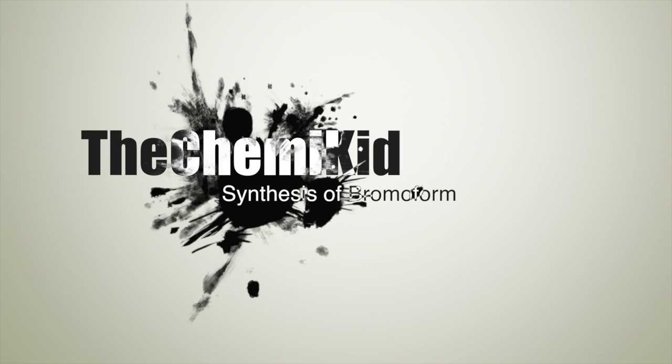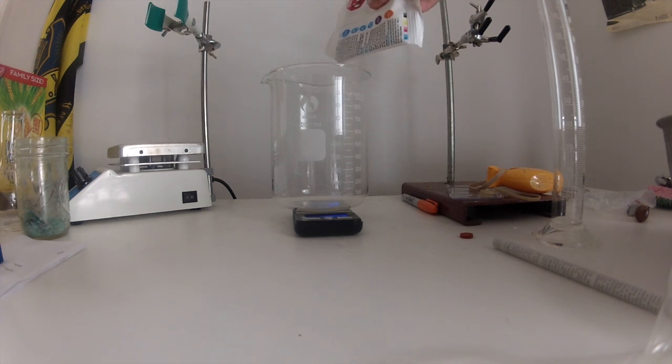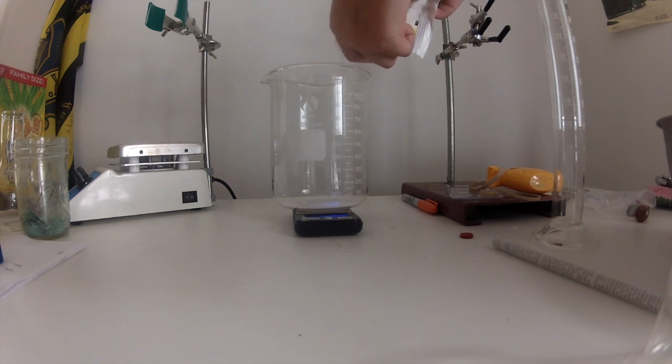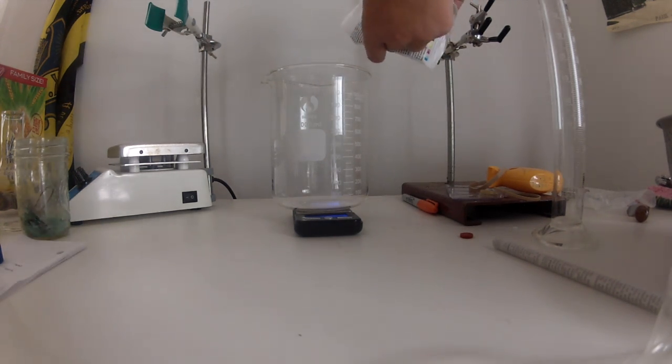Welcome to the Chemikid. In this video I will synthesize bromoform. First measure out 10 grams of sodium bromide into a beaker.